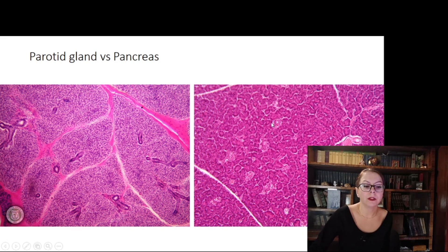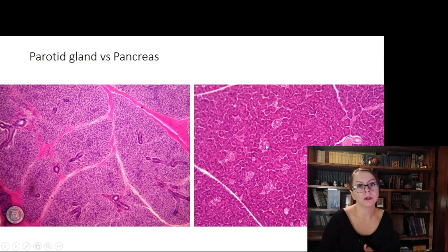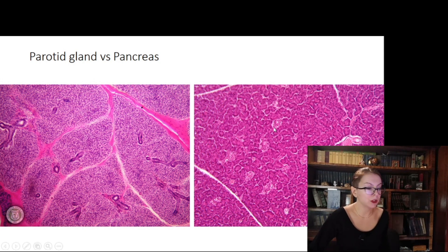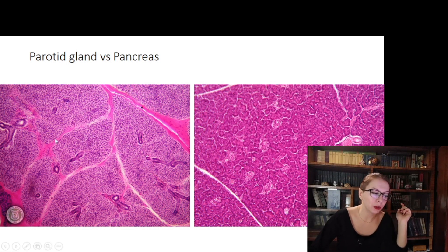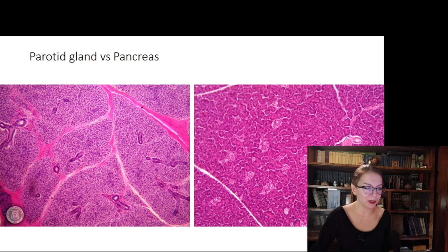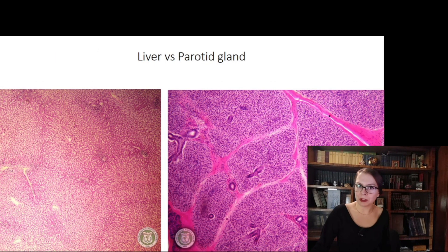The second criterion is the presence of islets of Langerhans. These are more pale compared with the exocrine part of the pancreas. If you can distinguish them, this is a criterion for the pancreas, as the endocrine portion is absent in the parotid gland. However, in some regions of the pancreas the islets may be absent, so this criterion is less reliable than the striated ducts. Also note that connective tissue is much more developed in the parotid gland than in the pancreas, where it is almost absent.